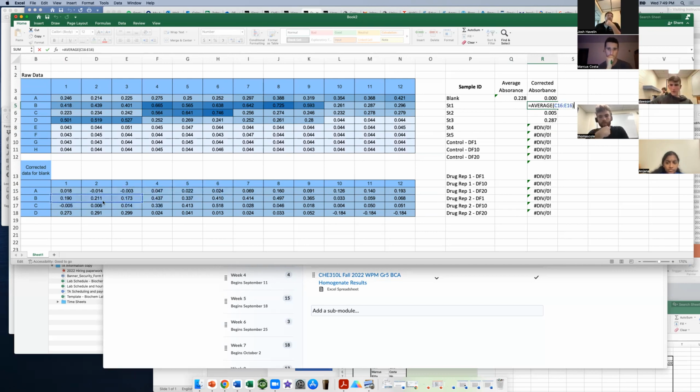So yep. How did you do that again? Because we have the same numbers as you, but we're not getting 0 for the blank and those other values for the other group. So we're averaging the value of these 3 cells.